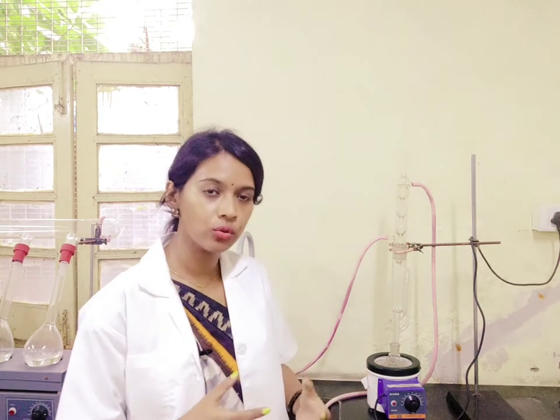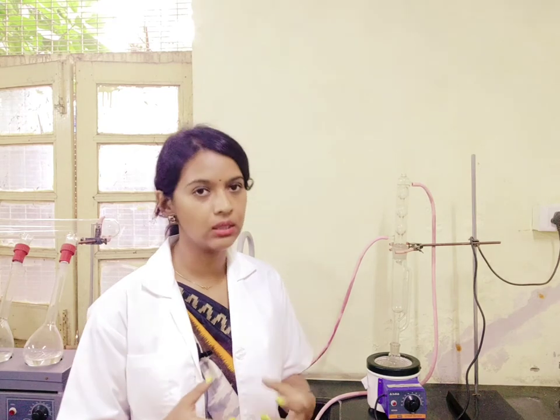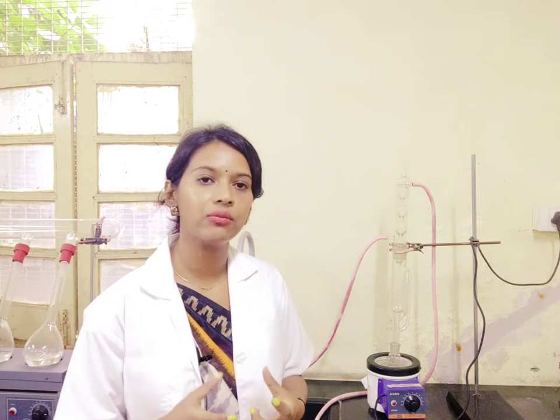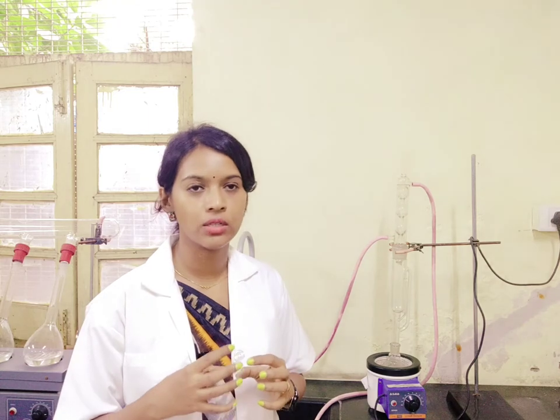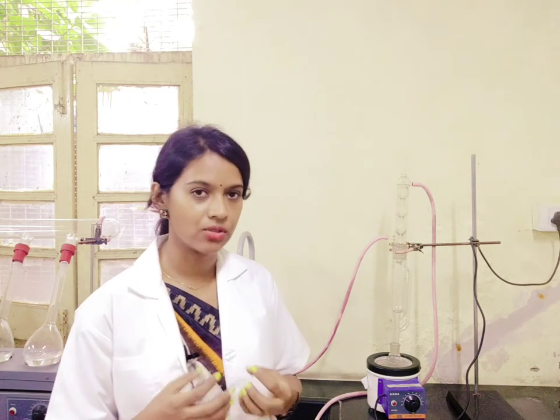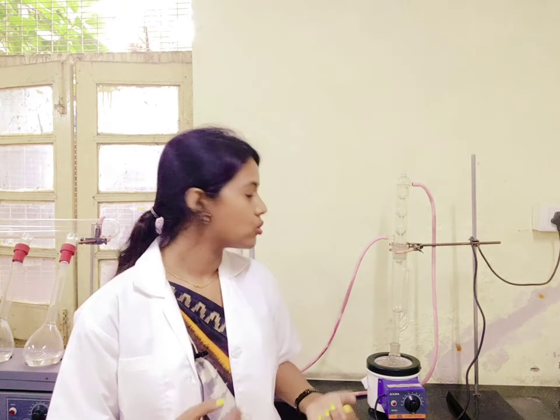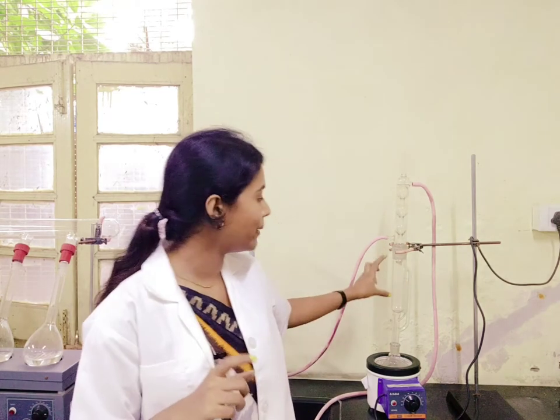Now talking about how to place the sample — whatever fat sample you want to extract, you have to weigh it and then place it in a thimble. A thimble is basically a thick filter paper through which the food sample cannot come out. It is only the fat that gets extracted which will come out through the filter paper and into the solvent.